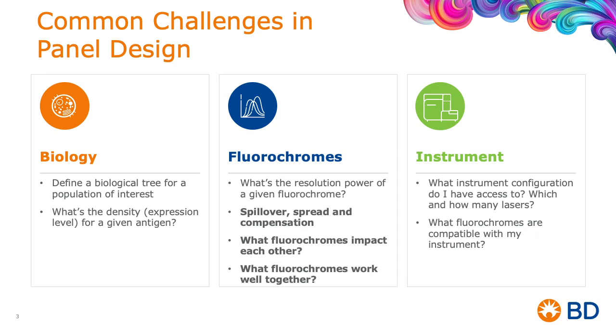We'll start by acknowledging and describing some of the common challenges in panel design. We'll then move forward to describe the benefits of using a 5-laser flow cytometer configuration. And we'll take a deeper dive into spillover, spread, and resolution before introducing the concept of a strategic selection of fluorochrome combinations with minimal spillover to simplify panel design and increase data quality.